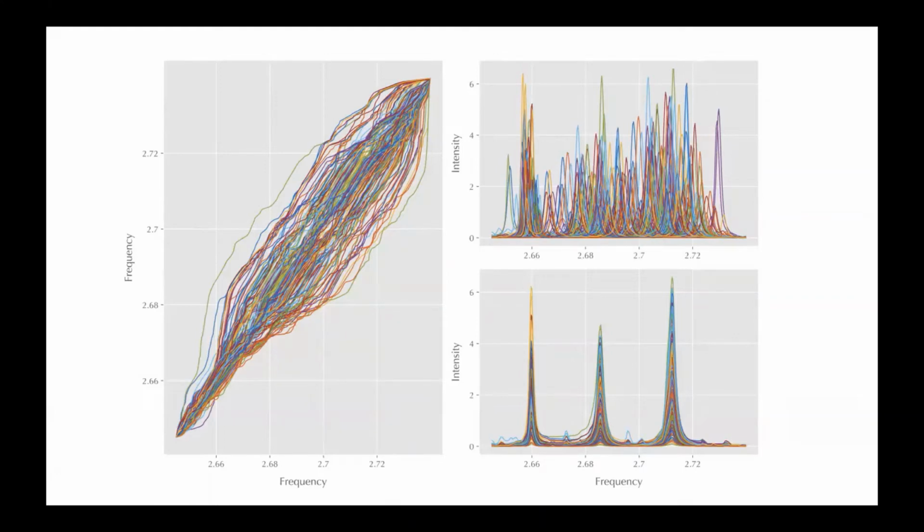And what's interesting too is we can look at the warping functions and we can say that this is a better, more accurate representation of the true phase variation in the data. And the interesting thing to note is that these warping functions aren't linear or translations. A lot of them are actually curved, which suggests that the phase variation is nonlinear, which means that the spectra are actually being compressed or stretched along the x-axis. The thing we notice is that the warping functions look fairly symmetrical about the main diagonal, which means that there seems to be an equal proportion of spectra shifting right and an equal proportion of spectra shifting left.